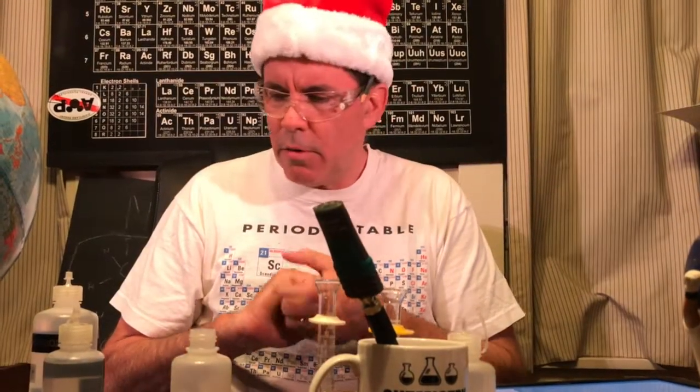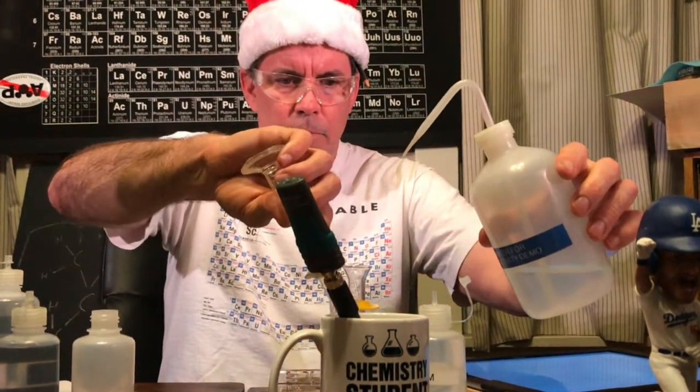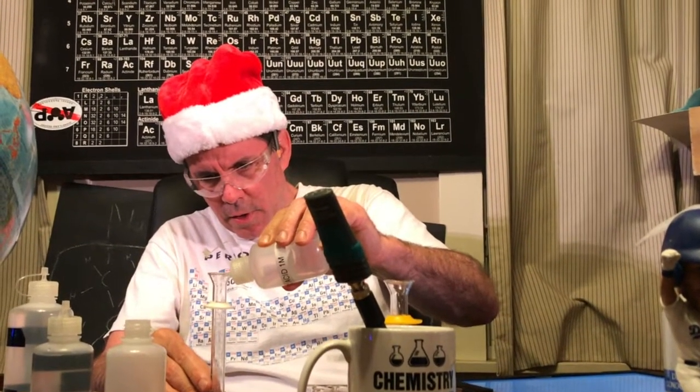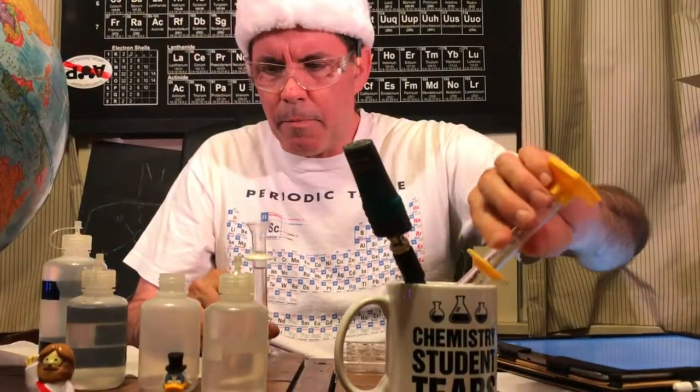Okay, now we're going to add 2 milliliters of the acid and 3 milliliters of the sodium acetate. So I need to make more of my acid. So again, I have 1.0 molar, and what I'm going to do is dilute it again, so that it becomes 0.1 molar. I'm adding 9 milliliters of water to 1 milliliter of the acid. It makes a total of 10. Get that meniscus. Let's rinse out our graduated cylinder so we can mix.